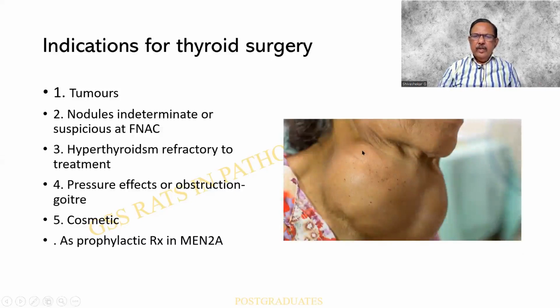And this, incidentally, obviously far exceeds the 50 grams that I have mentioned, but the lobulation or bosselation can be well made out. The pressure effects are self-explanatory.